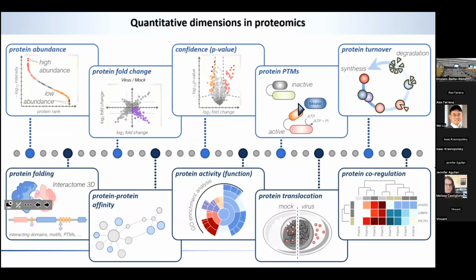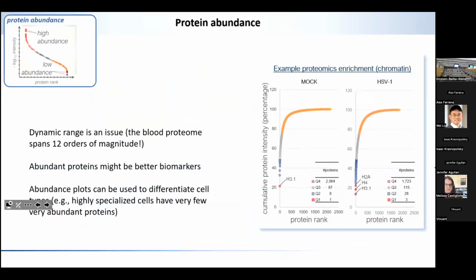I just wanted to shed light on the fact that we can be very, very flexible when we design an experiment in proteomics, particularly when we are using mass spectrometry. So speaking of these first 3 dimensions, there is something else that is maybe not as obvious to scientists that are used to working with sequencing data.